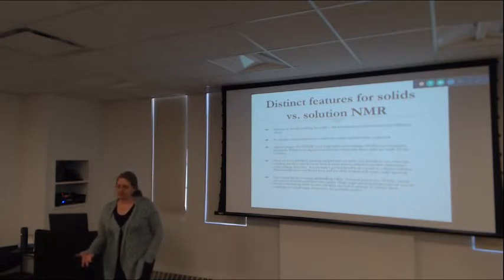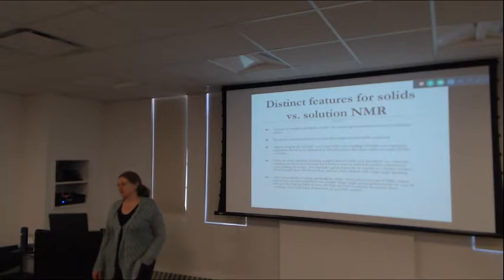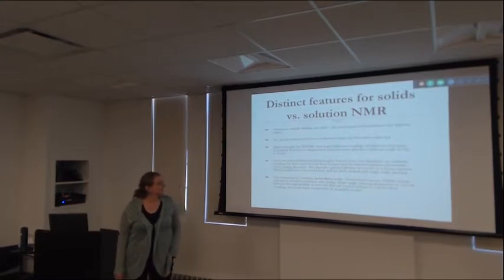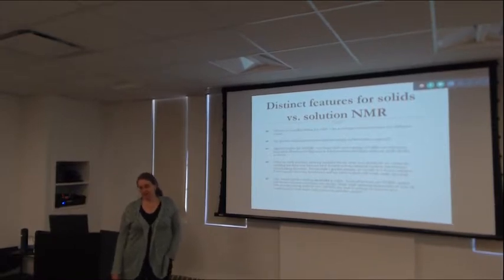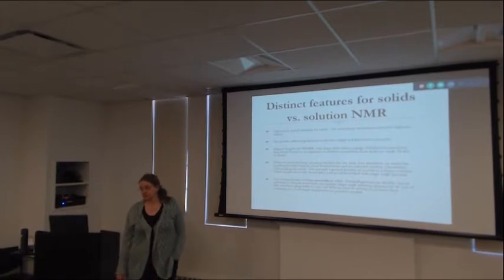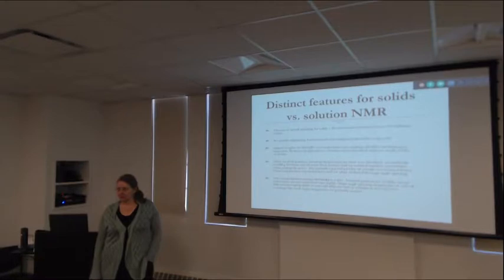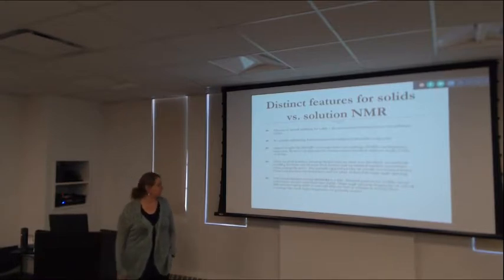So you represent all possible orientations. And a histogram in an ensemble, inhomogeneously broadened lines are expected. That's the kind of sample that's often studied with magic angle spinning. But instead of a crushed crystal, you might have a frozen solution of a protein of interest, or something that pelleted in the centrifuge, and you don't think that the centrifugation induced order, which is a question, for sure.